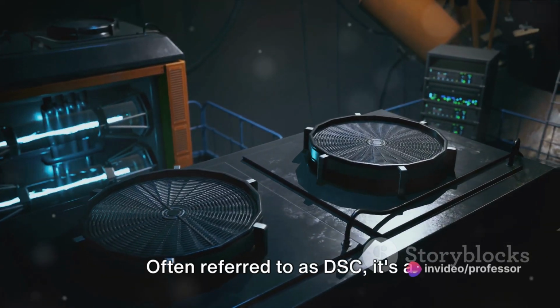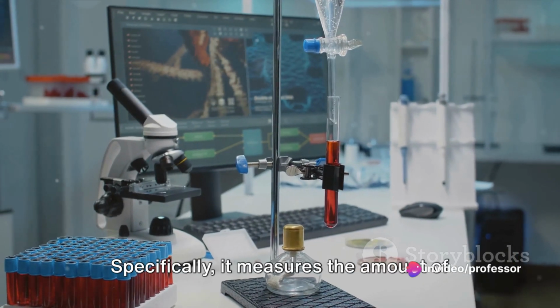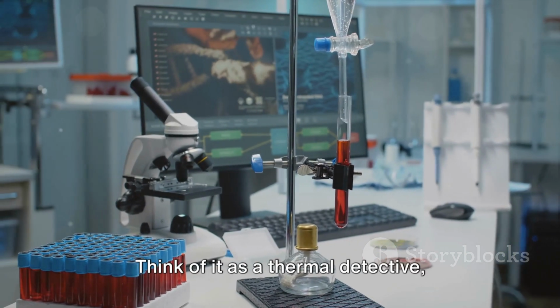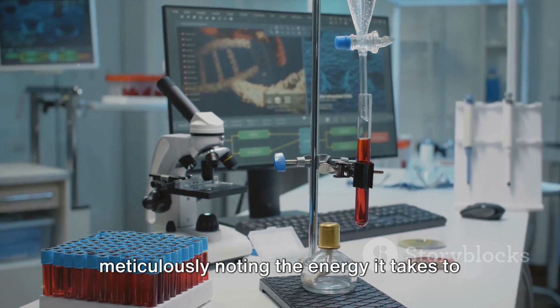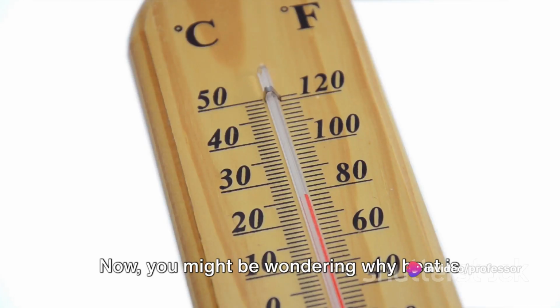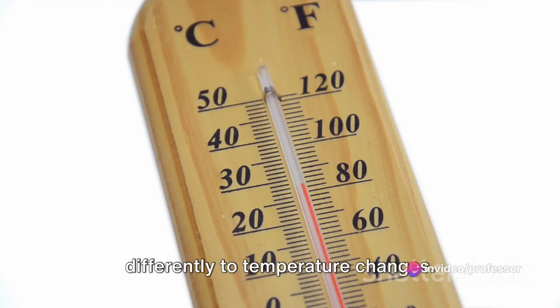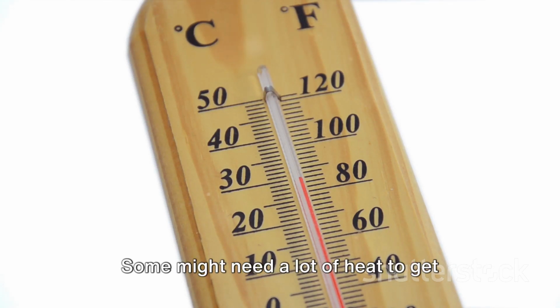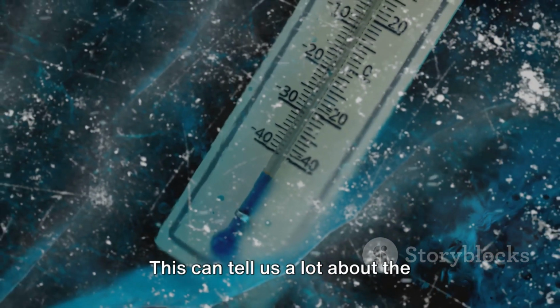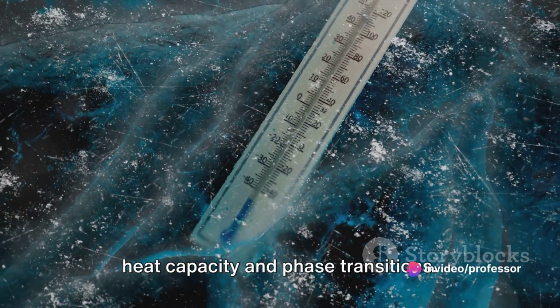Often referred to as DSC, it's a thermoanalytical technique that's all about heat. Specifically, it measures the amount of heat required to increase the temperature of a sample. Think of it as a thermal detective, meticulously noting the energy it takes to change a sample's temperature. Now, you might be wondering why heat is so important. Well, different materials react differently to temperature changes. Some might need a lot of heat to get warmer, while others might need only a little. This can tell us a lot about the material's properties, like its specific heat capacity and phase transitions.